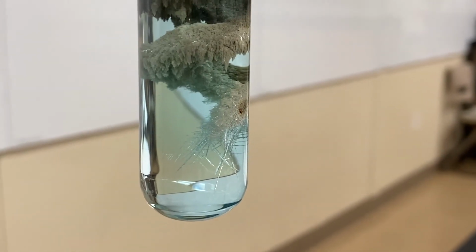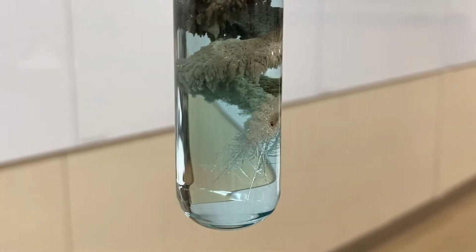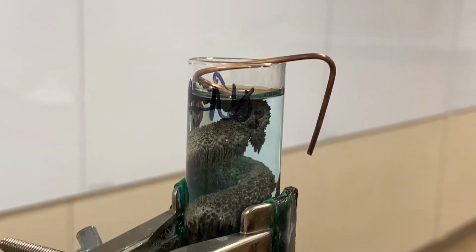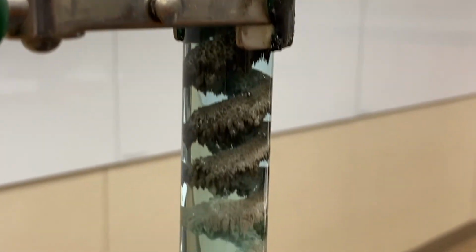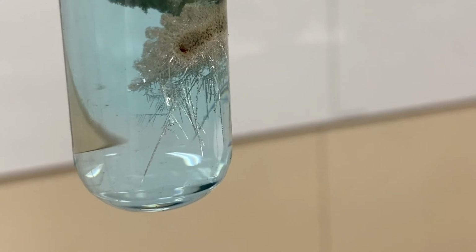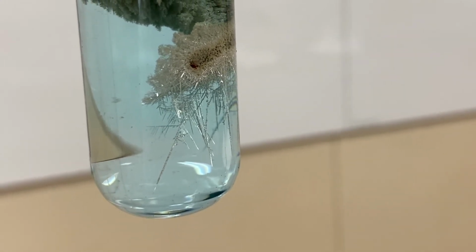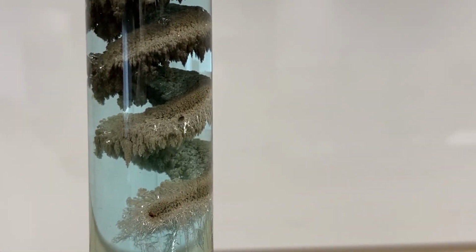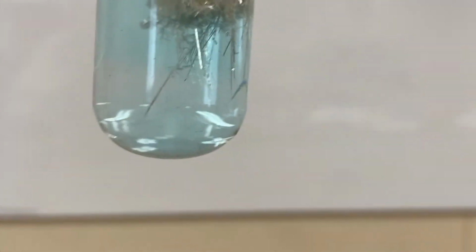And for all of you who made it this long and this much in lab, this is what our beautiful copper to silver replacement reaction is looking like. Isn't that great? Look at those crystals. It's been about an hour of this reacting. Pretty dang cool. Let's see if you can see it on the other side too.